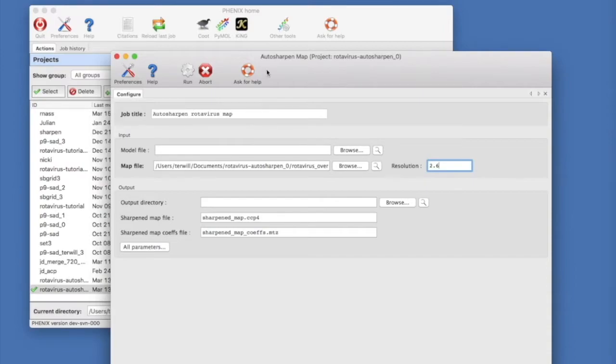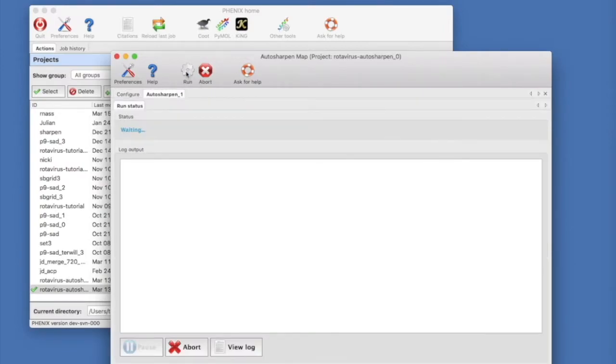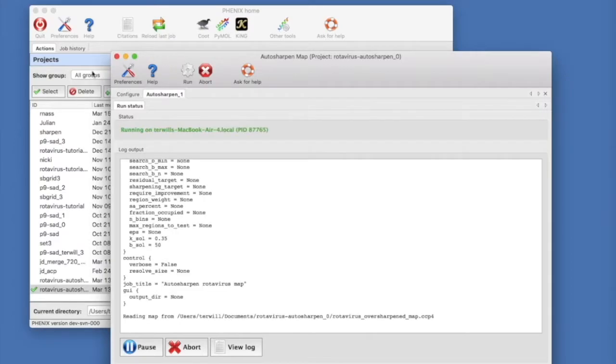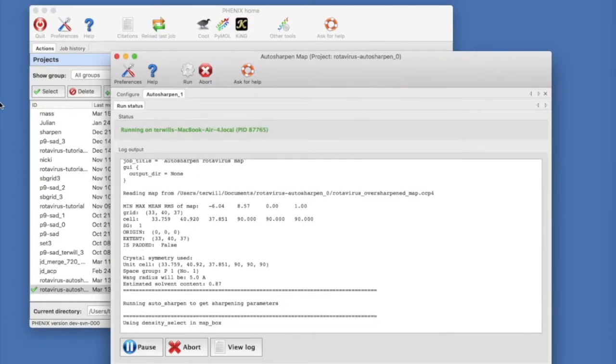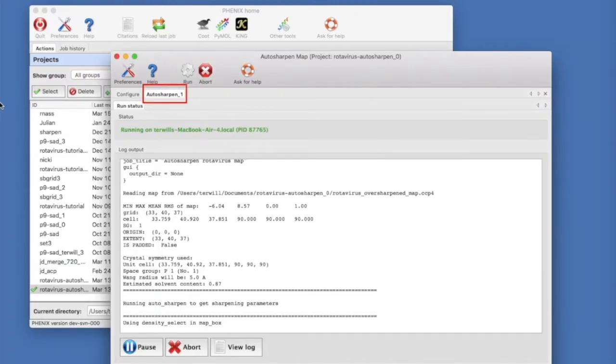Now we're ready to go. Hit run and the auto sharpen GUI will try to automatically figure out the optimal sharpening of this map. As the run starts, a new auto sharpen tab will appear and the log file is displayed in the run status window.